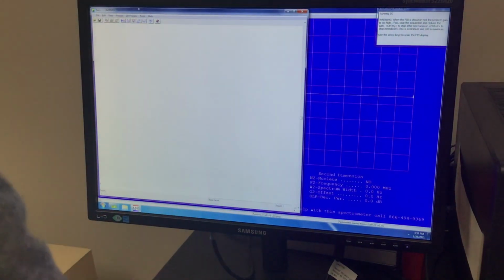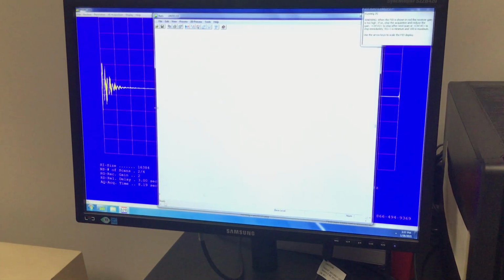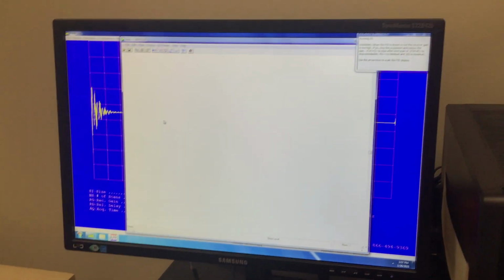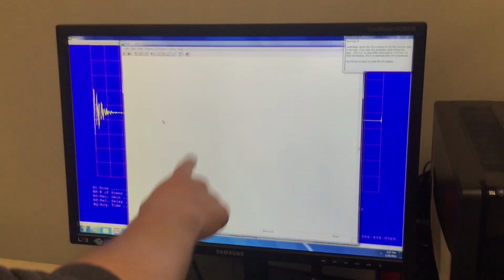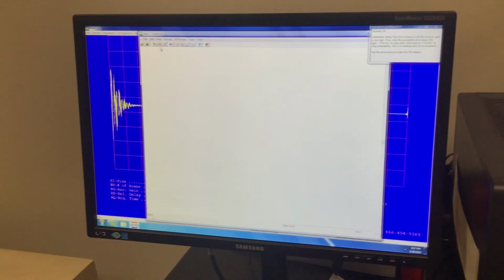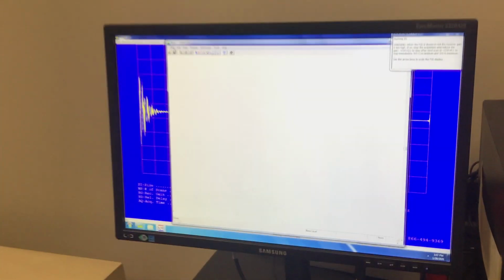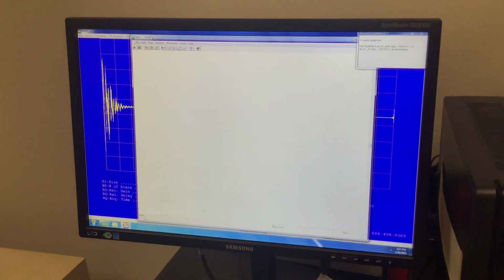In the meantime, I'm going to go back over to NUTS, and we're going to take a look at all of the pieces here. As of right now, there's nothing on the screen because I don't have an NMR to import into it yet, but it'll look something like this. Eventually we'll see a signal whenever this finishes. This window will disappear. That's how I know whenever it's done. We have various tools up here at the top that will aid in developing and interpreting the information that the NMR returns to you. You can also find the standard stuff, file, save, print, etc., the stuff that you've seen everywhere else. Okay, so now this is completed.